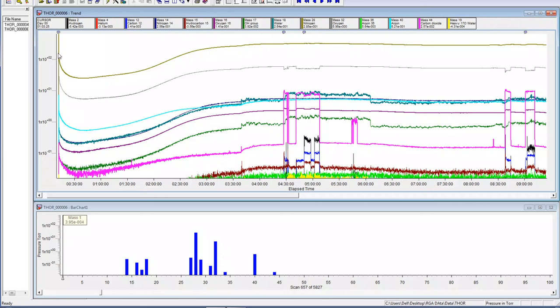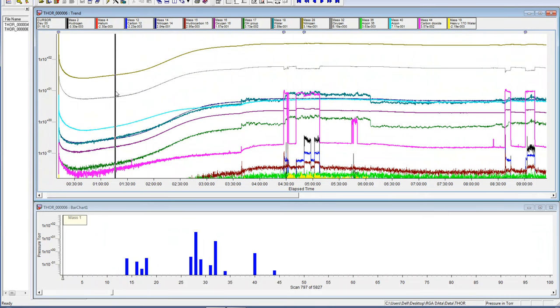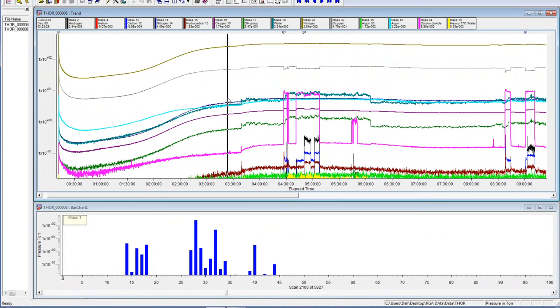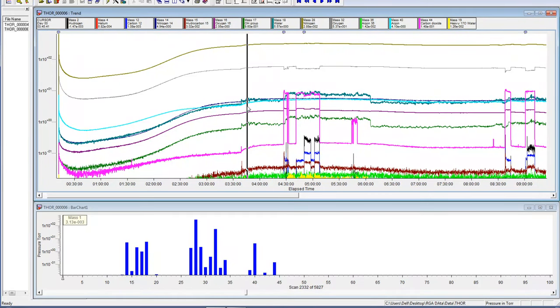I've got the logarithmic scale set so that nitrogen is in view, so we see big changes. This is the time it takes often for the RGA to get to a stable state. You have to allow two and a half hours or so for it to get to a steady state.